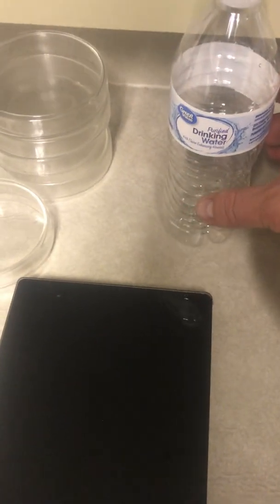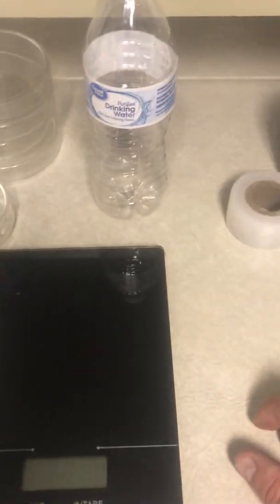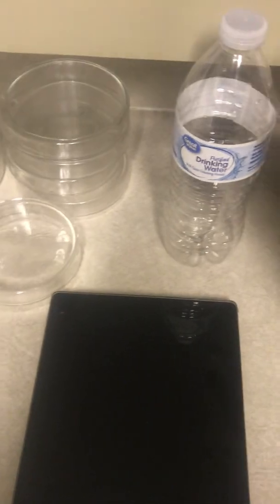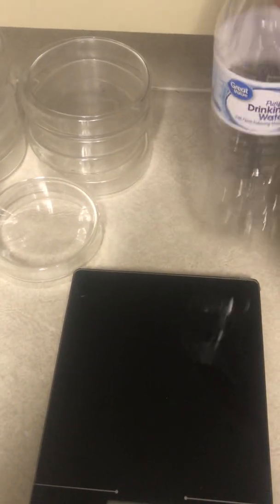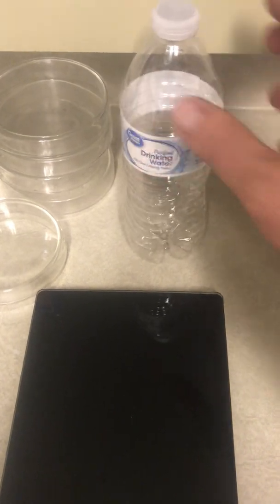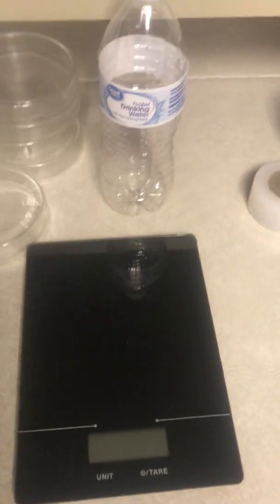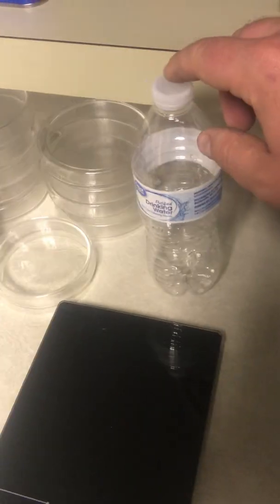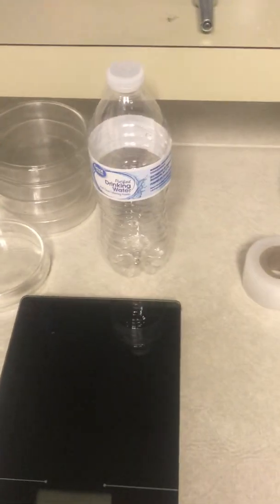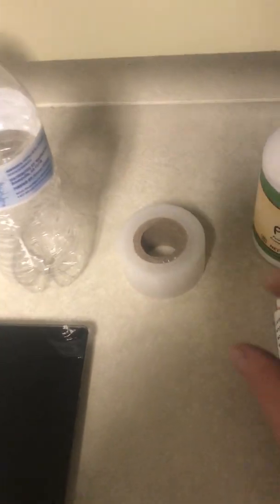The first ingredient for agar is water. You can use tap water, but I'm lazy — a 16.9 fluid ounce drinking water bottle from the grocery store is exactly 500 milliliters, so that's the first part of your recipe: 500 milliliters of water.